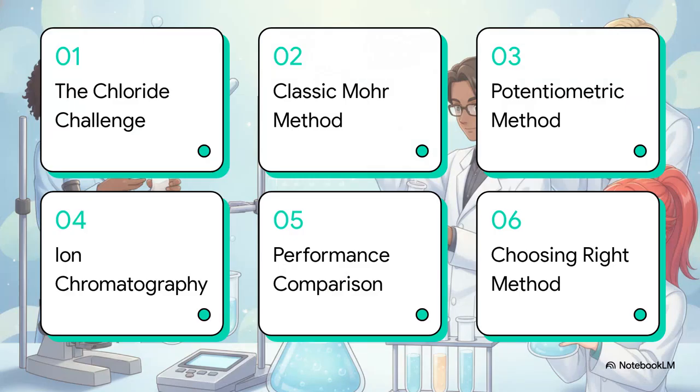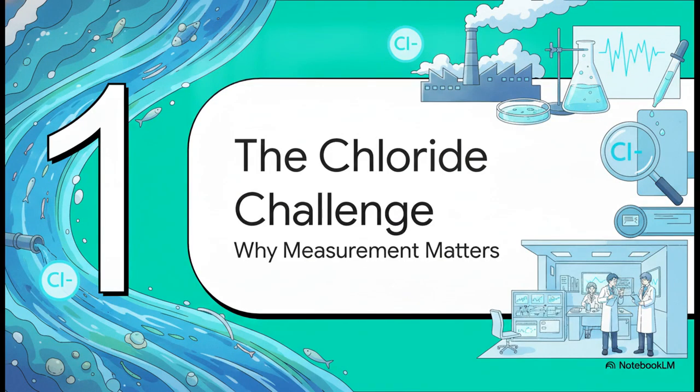Here is the agenda for our journey today. We'll cover the chloride measurement challenge, the classic titration Mohr method, potentiometry, ion chromatography, a performance comparison, and finally, choosing the right method. Section 1, the chloride measurement challenge.